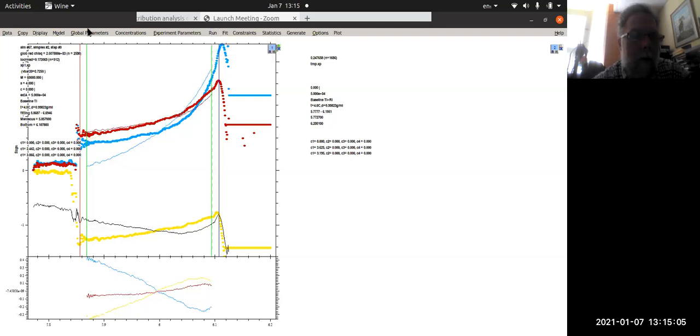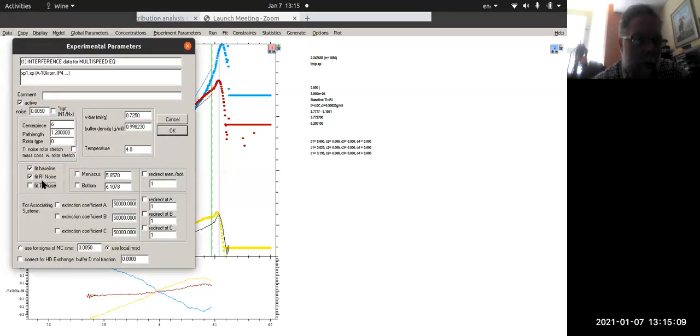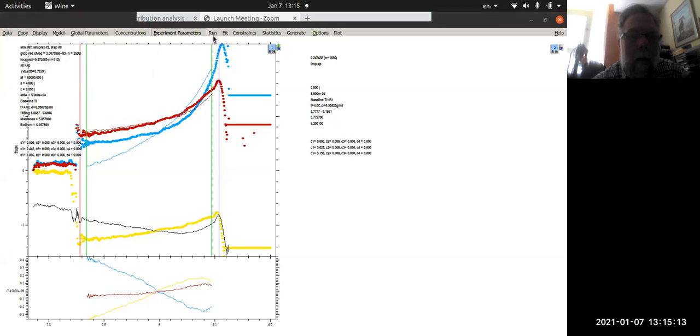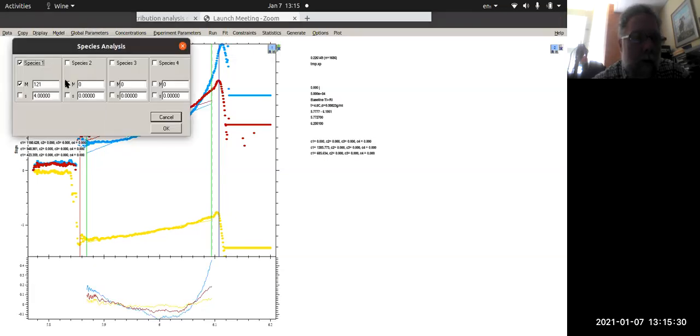I don't know. All right, that looks a little better. And so then if I fit this from 60,000 daltons, hopefully it'll give me lines. Really? That's totally bizarre. All right, well, it's misbehaving somehow.